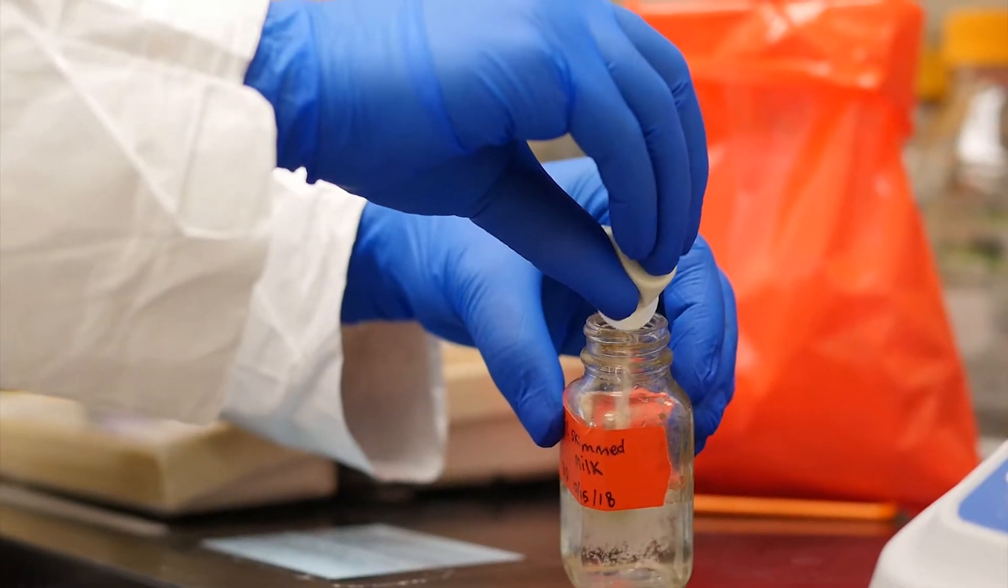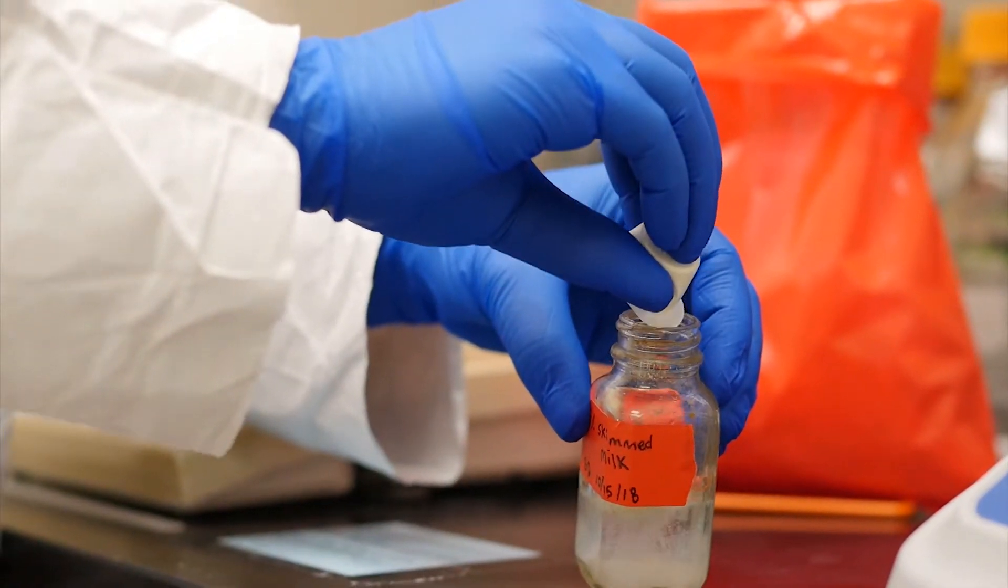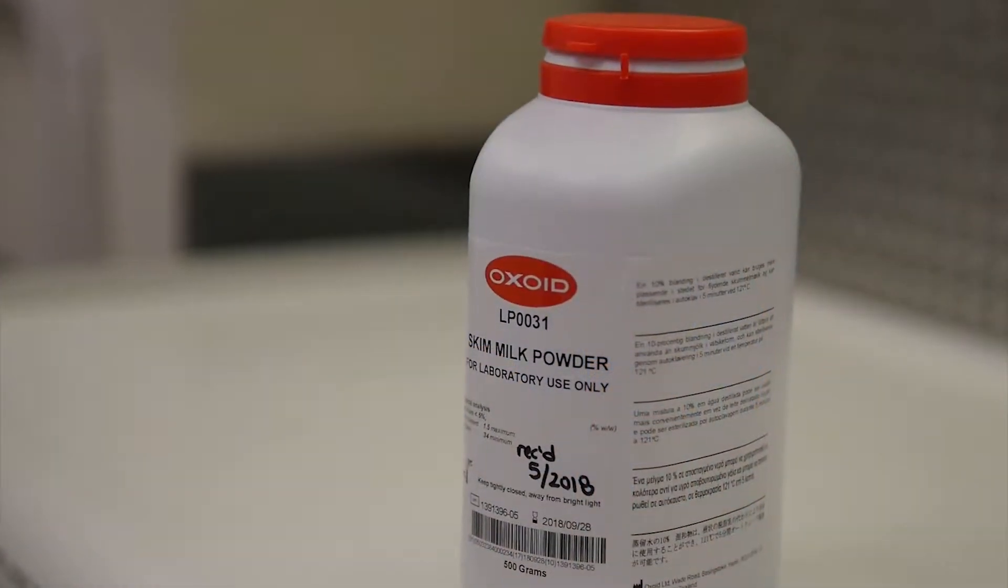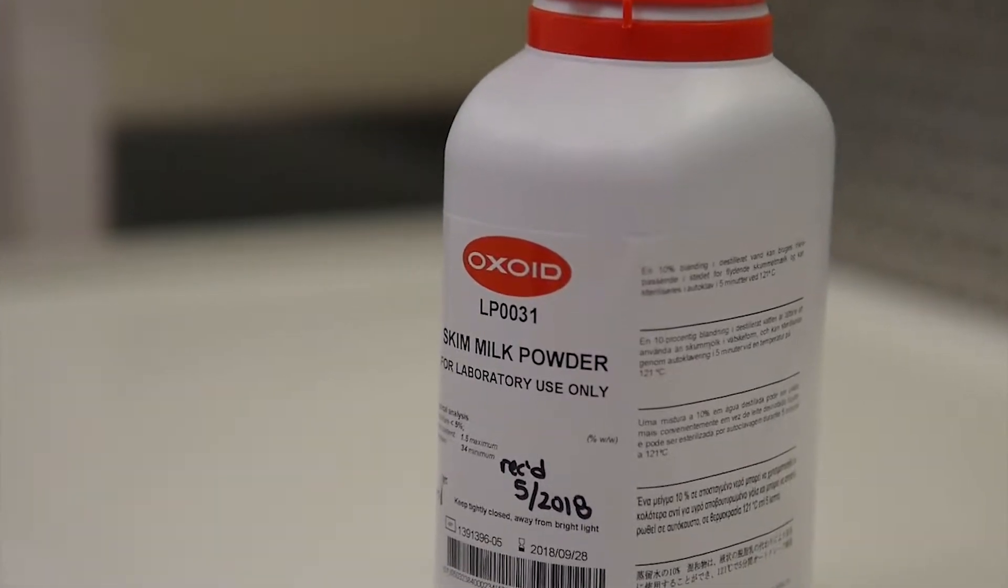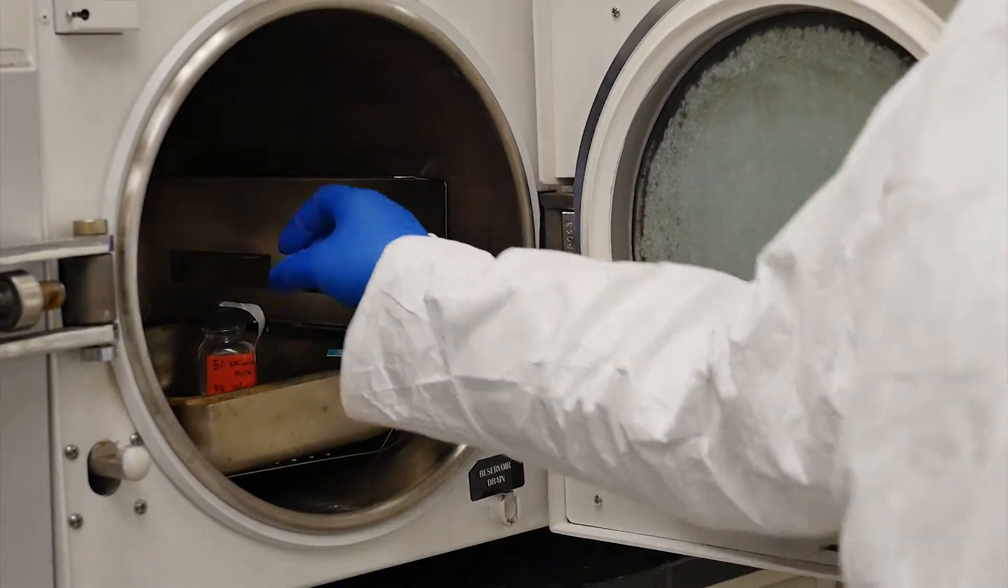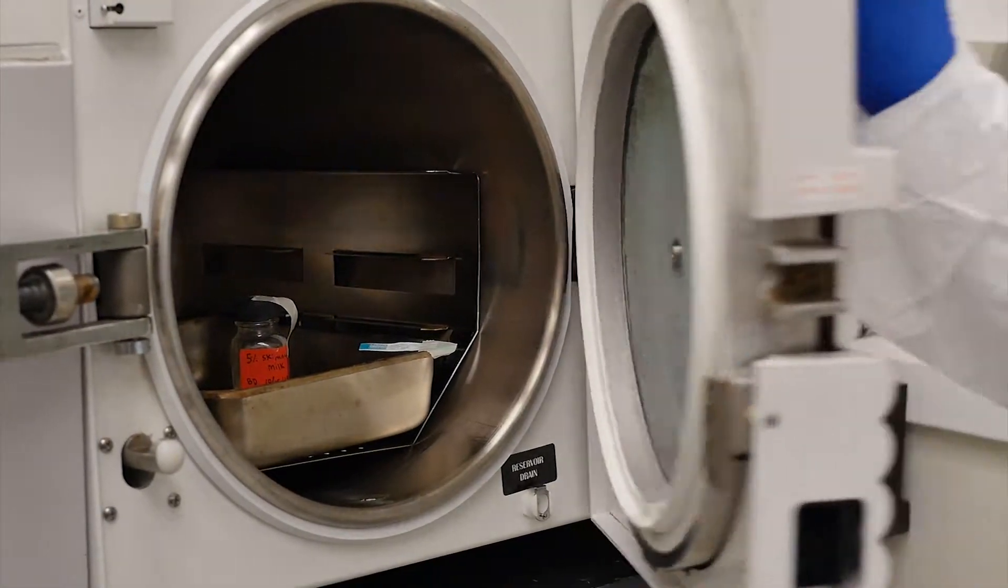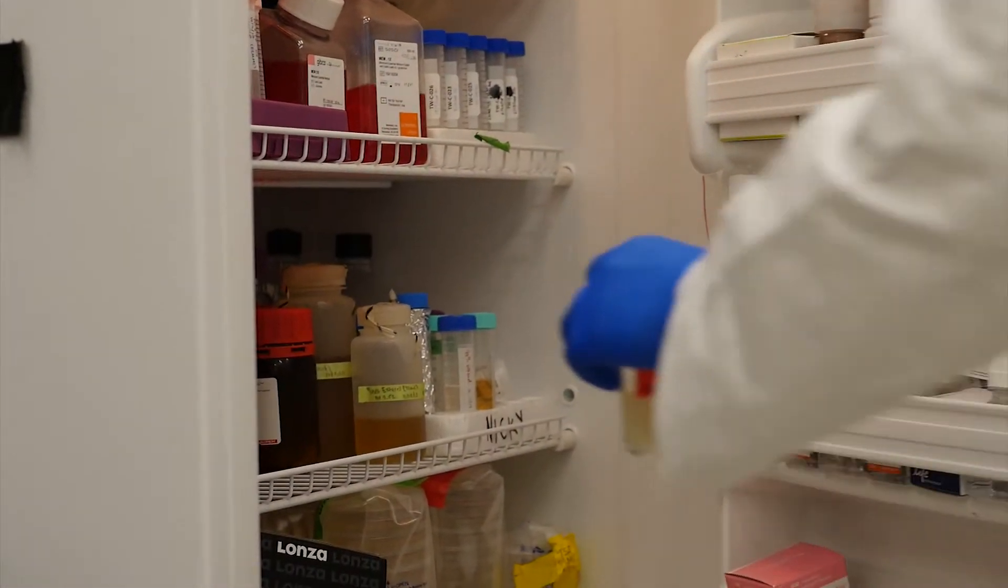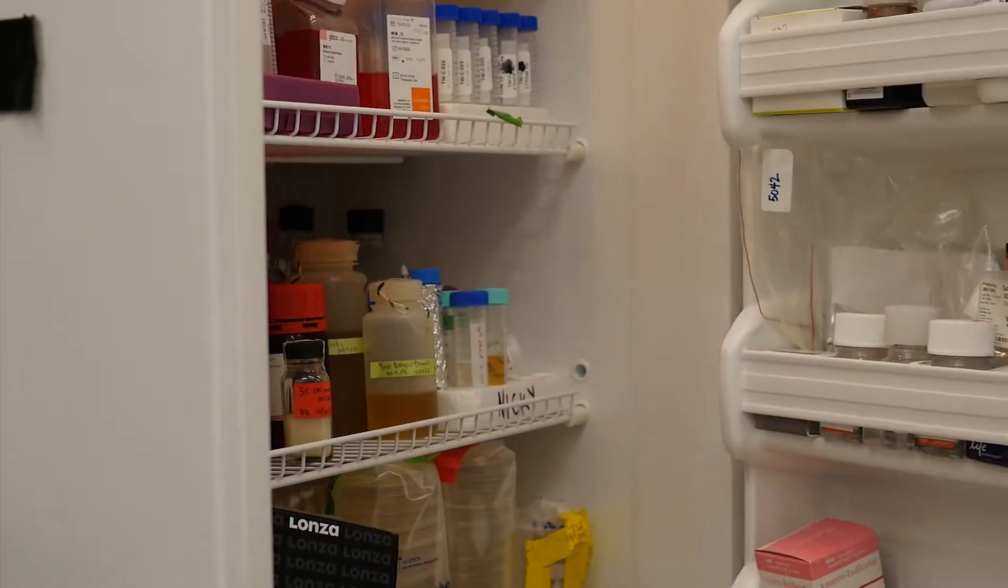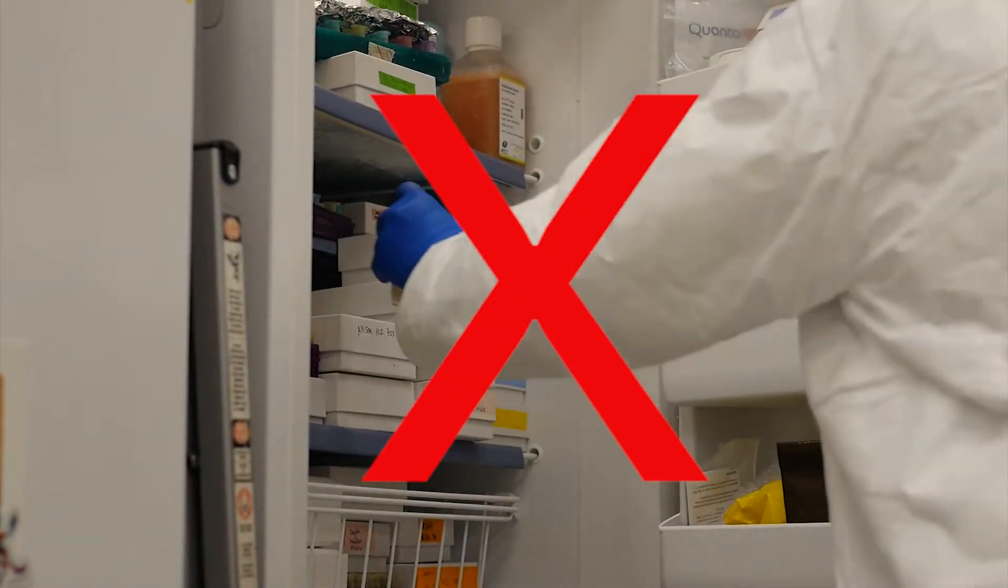Next, prepare your 5% skimmed milk solution. Oxoid skimmed milk powder is the validated reagent brand for this protocol. The skimmed milk should be autoclaved at 110 degrees Celsius for 15 minutes. You can store the skimmed milk at 4 degrees Celsius for up to 3 days. This solution should not be frozen.